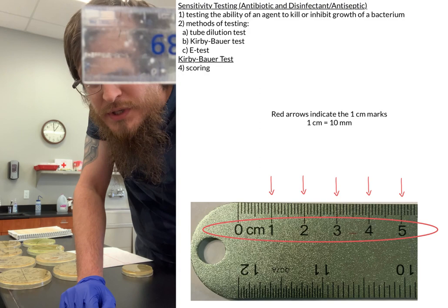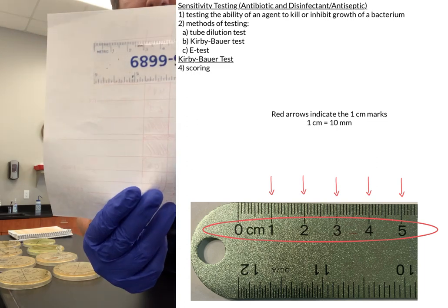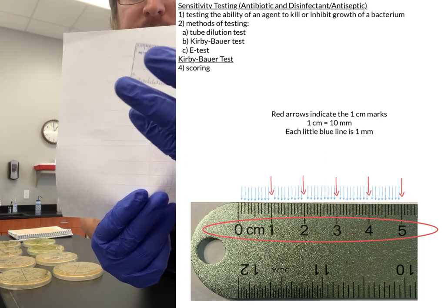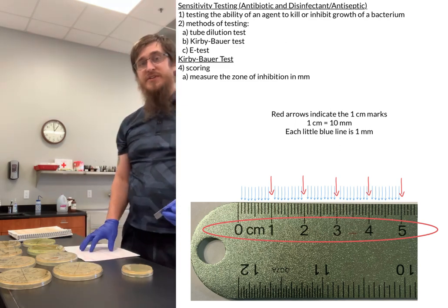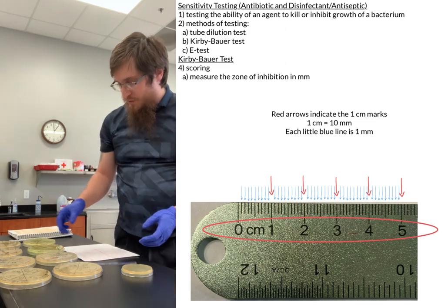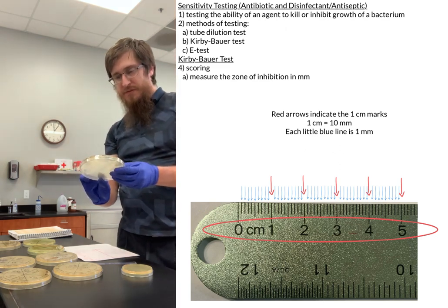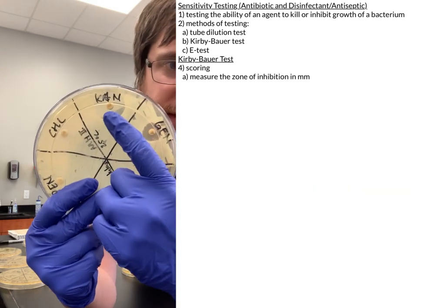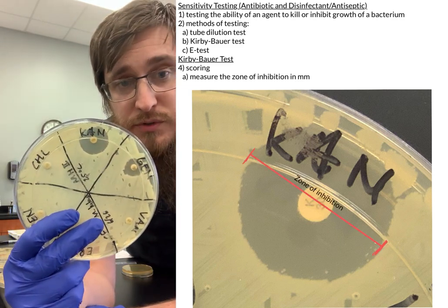So what we're actually measuring with are those tiny little lines in between our numbers. Each of these tiny lines is 1 millimeter, and that's what we're going to be measuring in order to get what we call a zone of inhibition. When we're looking at our plates, we have to measure the zone of inhibition, which is the clearing. This clearing of growth is what we call the zone of inhibition, and that's what we want to measure.